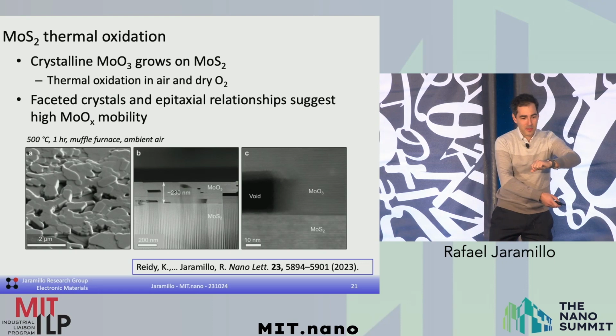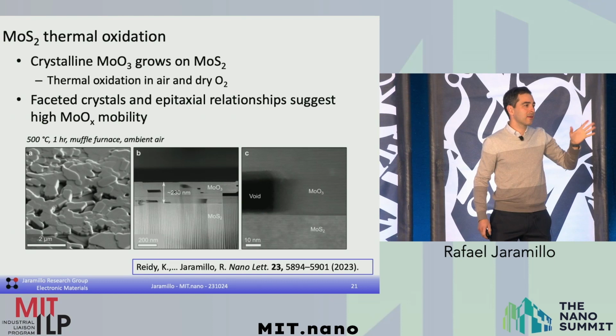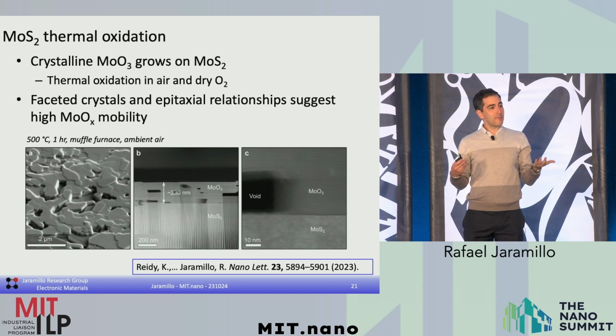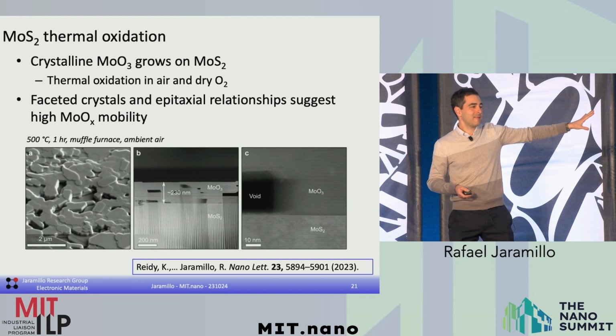To give a snapshot, the left-hand picture is an SEM micrograph of what happens when you oxidize molybdenum disulfide. If you take a silicon wafer, put it in an oxidation furnace, and take a micrograph afterwards, it looks almost unchanged, because the oxidation proceeds leaving all of the silicon atoms more or less in place, just the growth of an oxide as oxygen diffuses in and disrupts the crystal structure. Here we don't get that at all. We get, in a sense, beautiful crystallites of oxide growing on the semiconductor. Beautiful things to look at in the microscope, but totally useless if you're doing planar device processing.